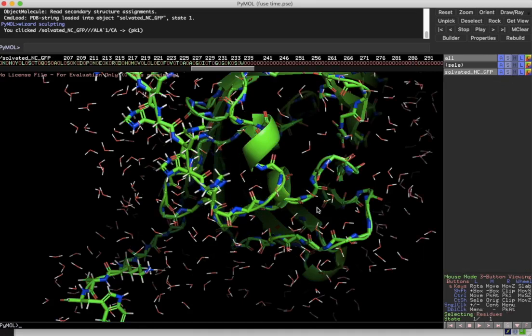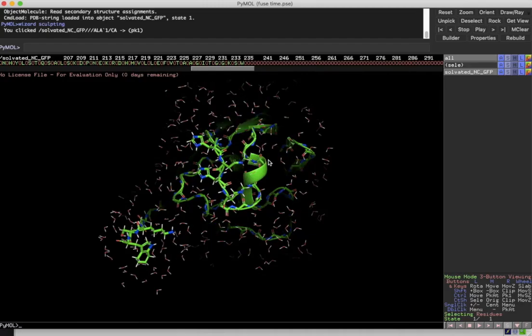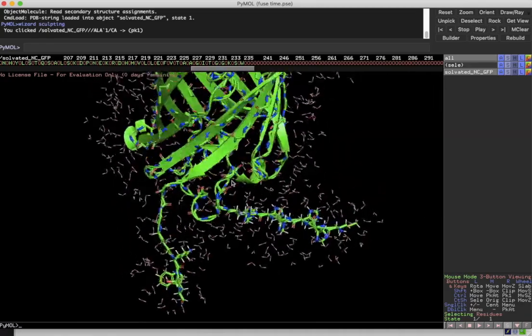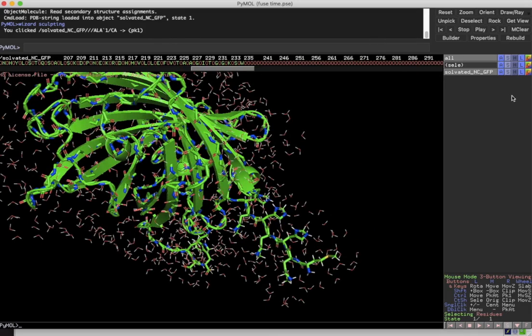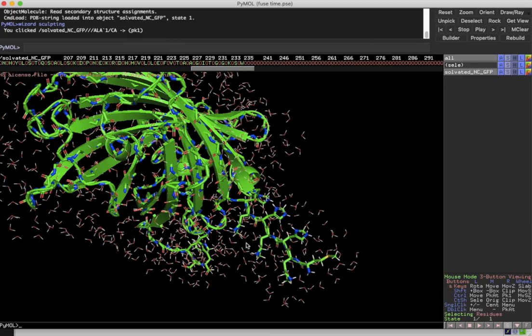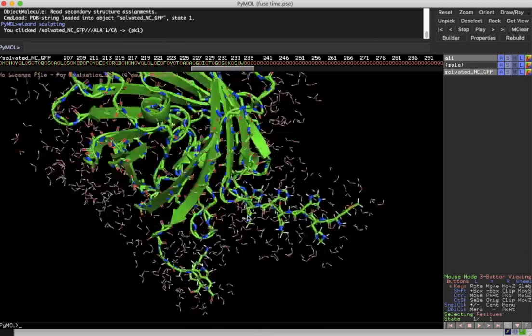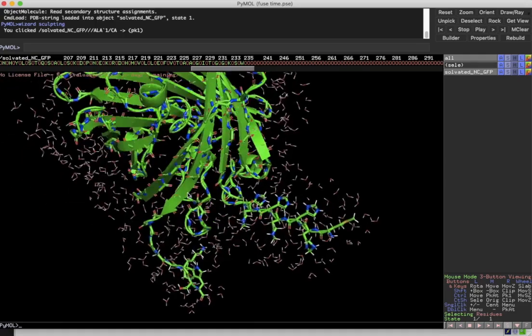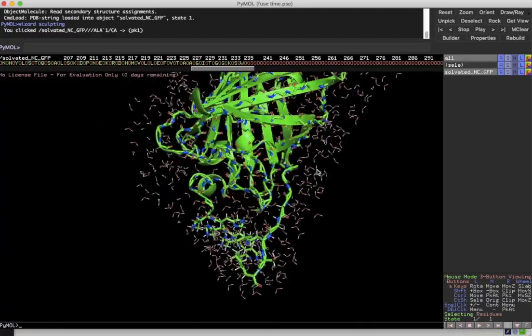So I'm going to click done here, and again, this could go on and on and on. Let's show the ribbon, let's show the cartoon, oh, I already am, in the side here. Let me hide the side chains, because one thing that is happening is this is getting more and more wiggly. It's like the backbone here is slowly kind of coiling even a little bit. Okay.